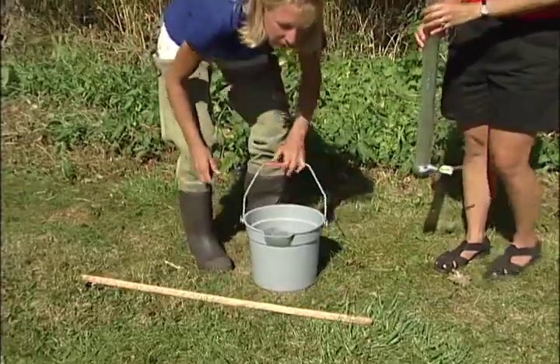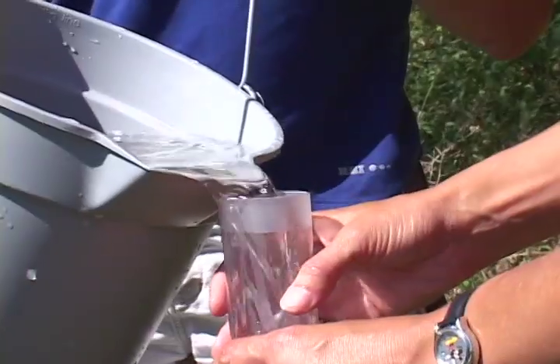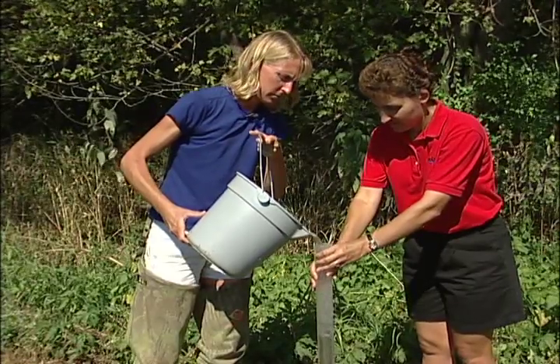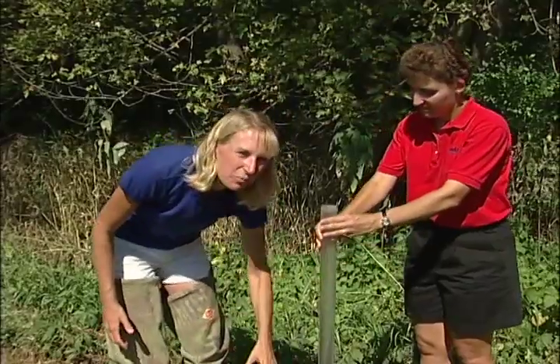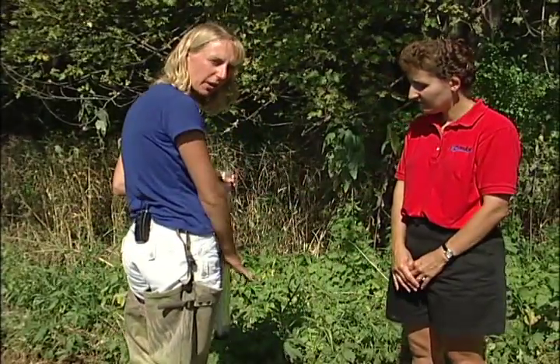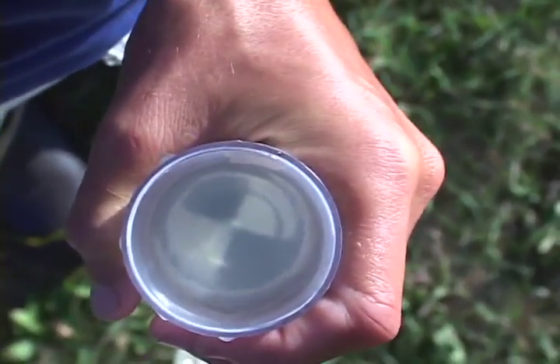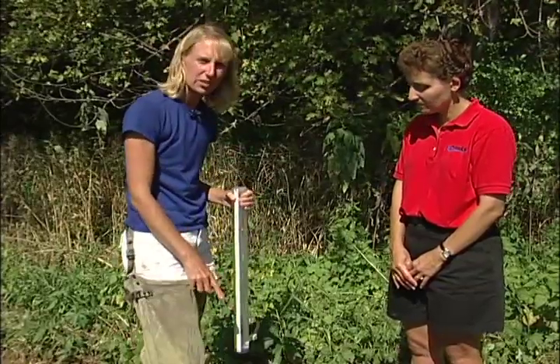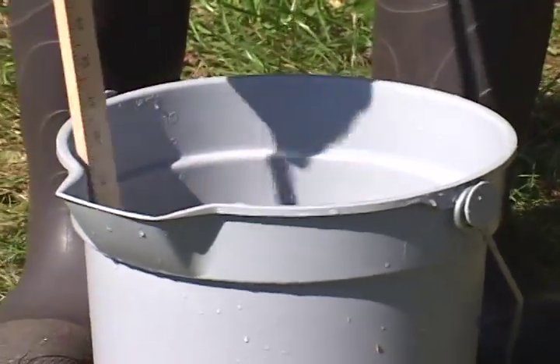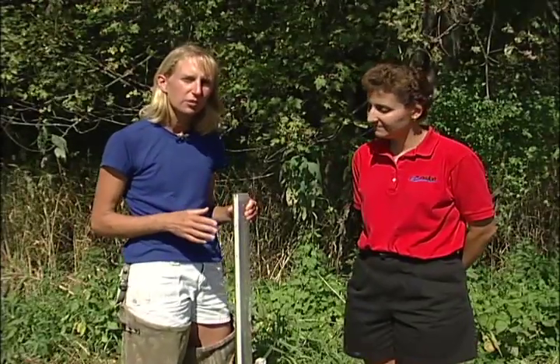Then take the bucket and fill up your turbidity tube. Do the same thing as demonstrated before — shade your tube, look down through the water column, and see when you can just barely see that Secchi disc in the bottom. Do this two times, each time making sure to stir up the water sample so that the sediments are still suspended. In the end you'll have two turbidity measurements written on your datasheet.